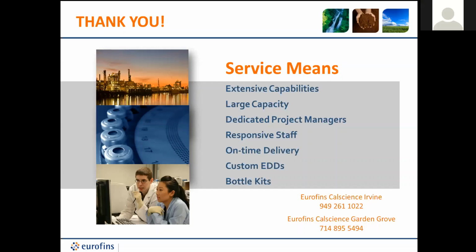So you said you would run them as discrete? Probably discrete individuals, and maybe you report it. But what do you mean by that exactly? So a discrete sample is an individual sample. Discrete samples can be composited together to give you a composite sample. So we might just run the discrete, and then you can analytically calculate results, an average or whatever you need to do there. I think it just depends on exactly what the permit states. So you composite by analytical method as opposed to physically mixing the bottles. For oil and grease, yeah, it's tough.